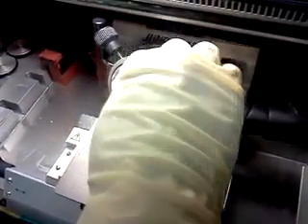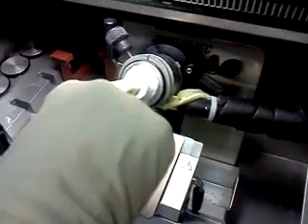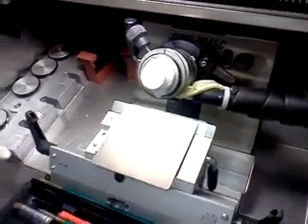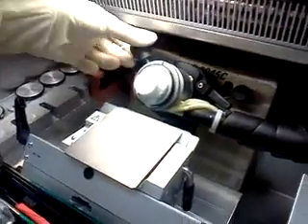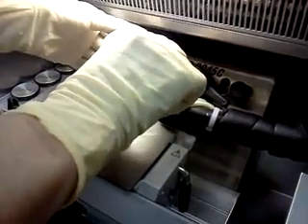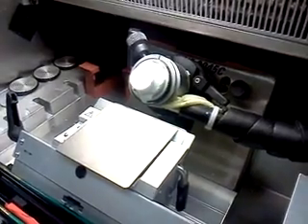So if I put it there, it's going to cut it weird, right? So it's clear that it's got to be up there, right? Now, this doesn't look good. See that? It's not nice and white like that. That means it's got freezer burn type stuff on it. That's not good. You don't want it to look like that. But this is old tissue that we've been practicing with, so I'm not worried about it. But I wouldn't like it if it was the real deal we were going to do something with because of that.